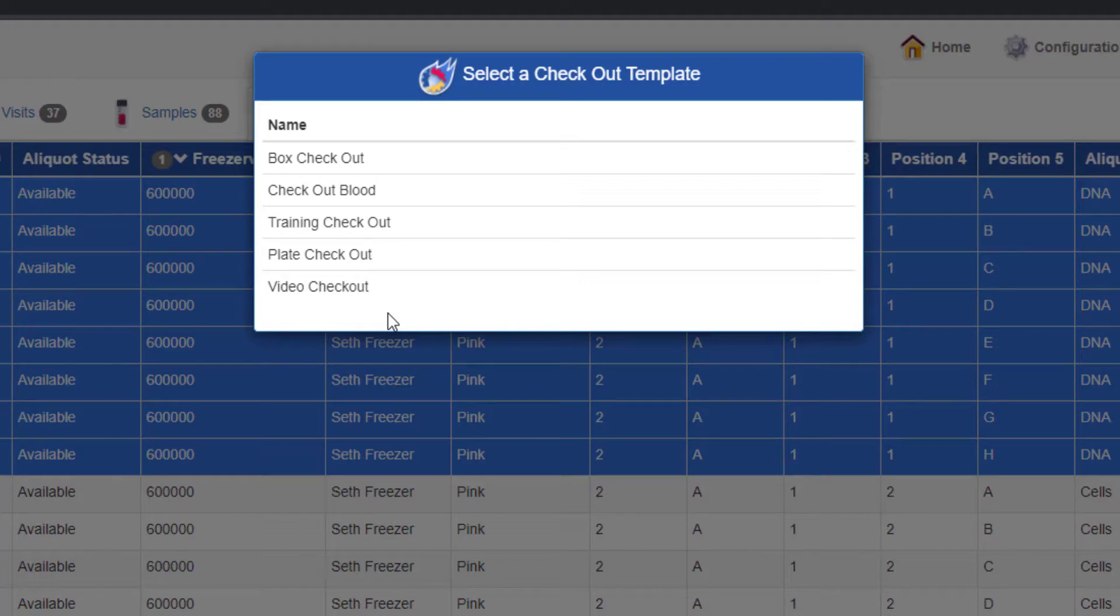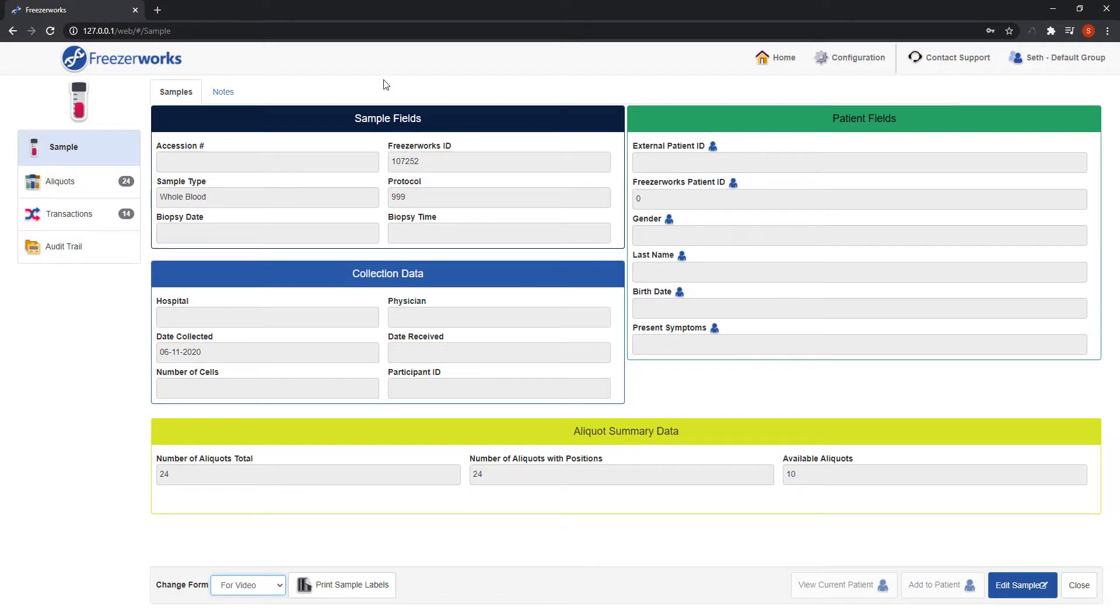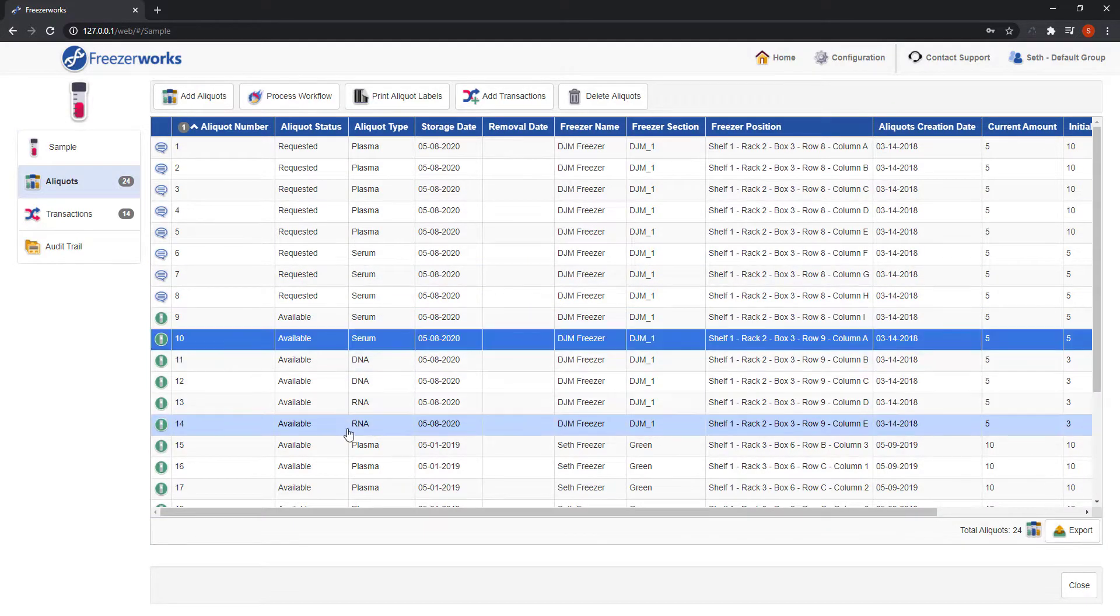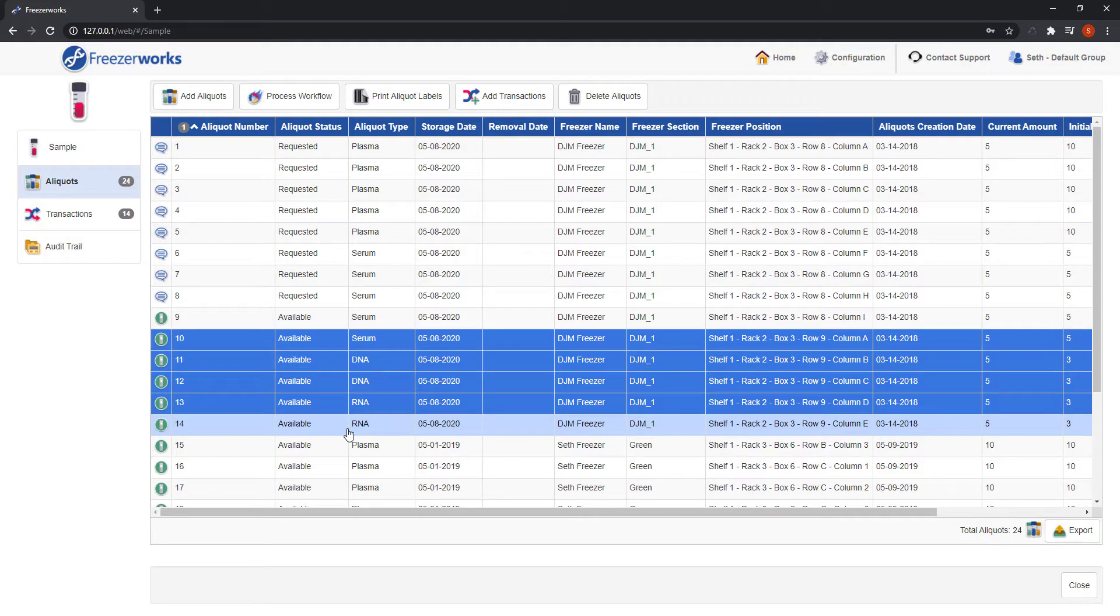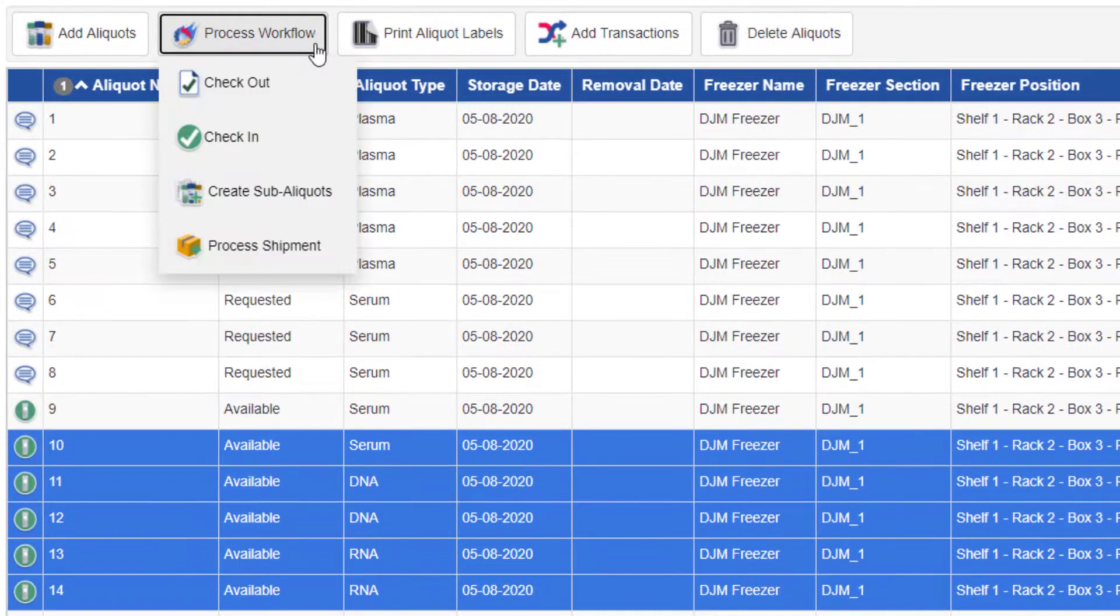Now before moving on to the process workflow form, let's quickly mention the other spots you can start a workflow from. Whenever you open and edit a sample in the new samples entry forms on the web, you can run any of the workflow types on its aliquots. Simply go to the aliquots page, highlight the aliquots you want to work with, and click the process workflow button.